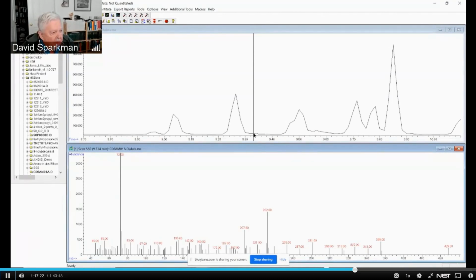There was another peak at m/z 72, and that is an even value, which could be a fragment ion that contains an odd number of nitrogen atoms, which means that the molecular ion, if 232, based on the nitrogen rule, would be an ion with 2 atoms of nitrogen.